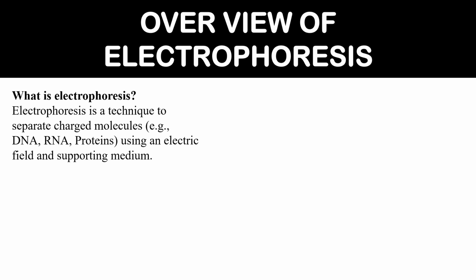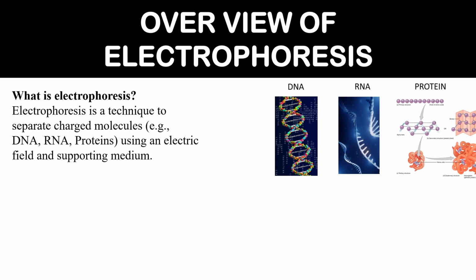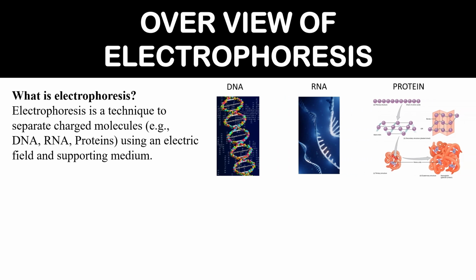In this video, I'm going to explain the overview of electrophoretic techniques. So let's start. Electrophoresis is a widely used molecular technique used to separate charged molecules like DNA, RNA and proteins using an electric field and a supporting medium as well.